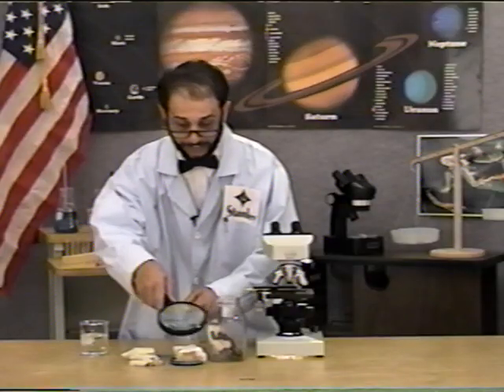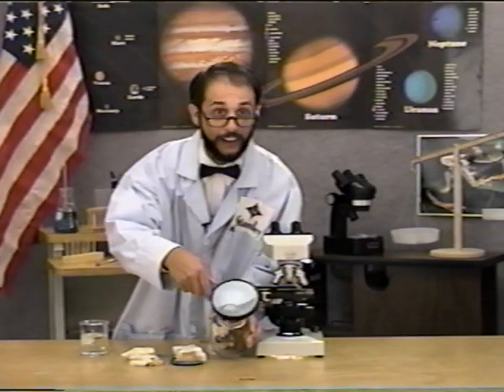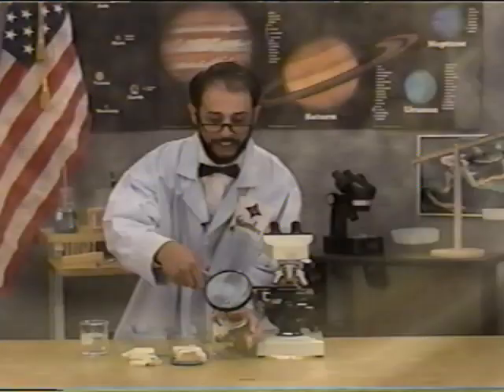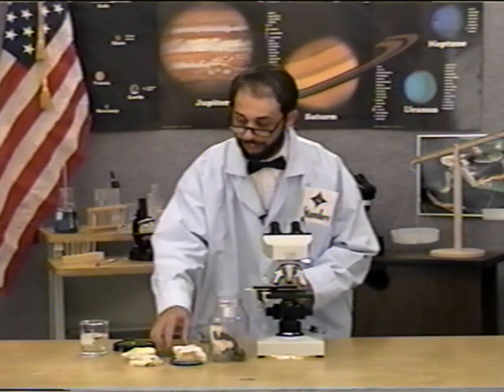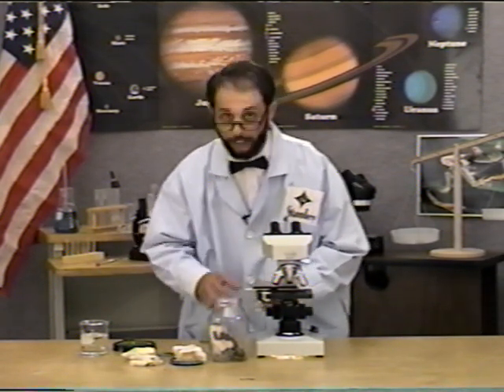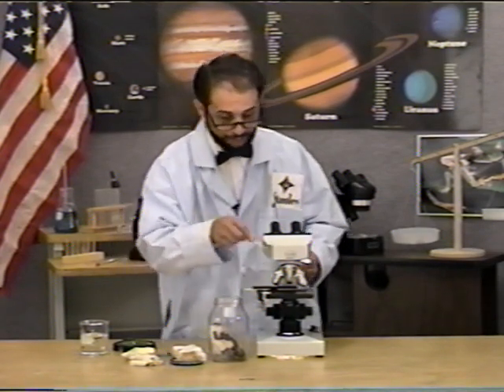There's some mold here that's about 2 weeks old. And then I have some mold in the jar here that is about 3 weeks old. We'll take a look at some of this very well-developed mold and examine it under a magnifying glass or a microscope.